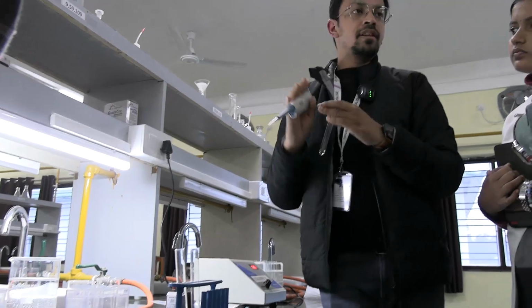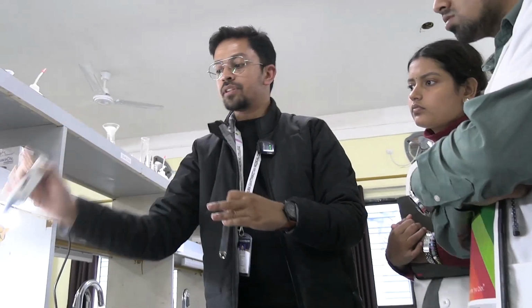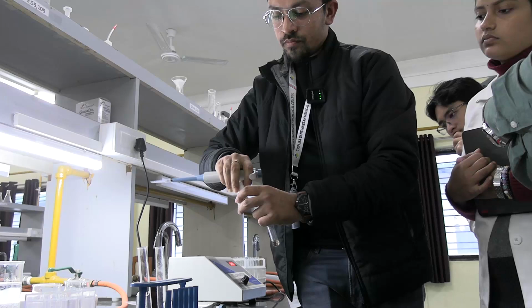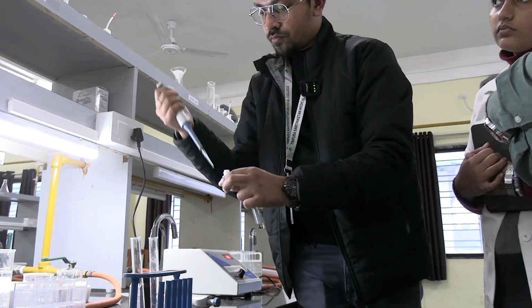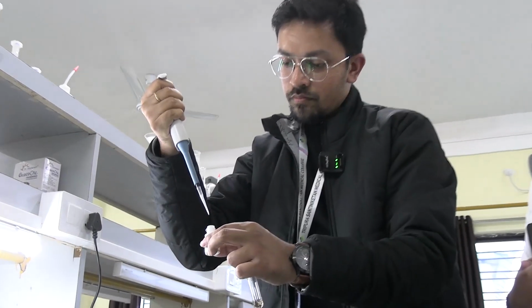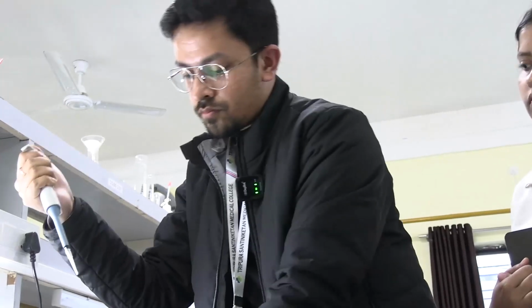Now after doing this distilled water, I am supposed to change the tip. But I know that this is distilled water, so there is no contamination over here. There will be no chance of contamination. So I can use the same tip and I can take the standard. Done.